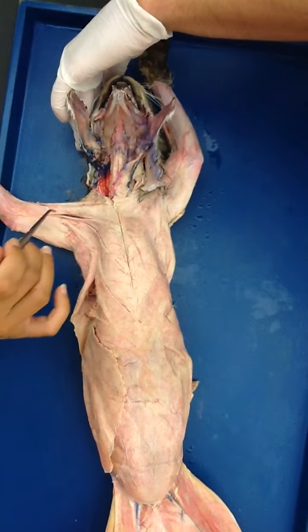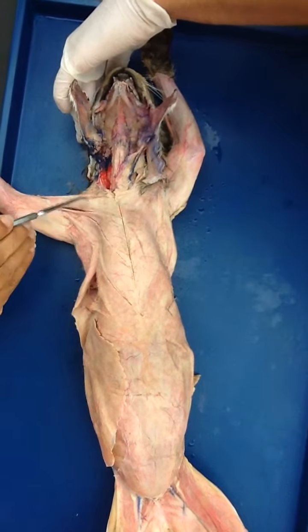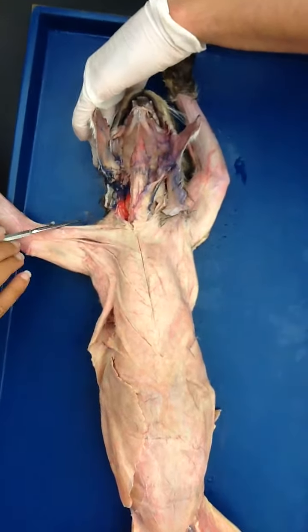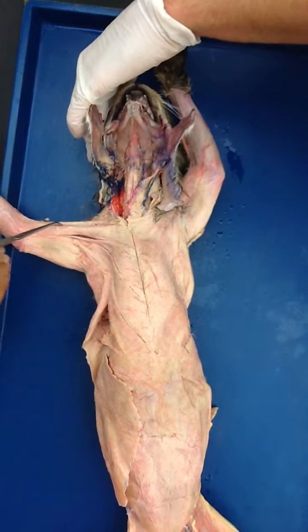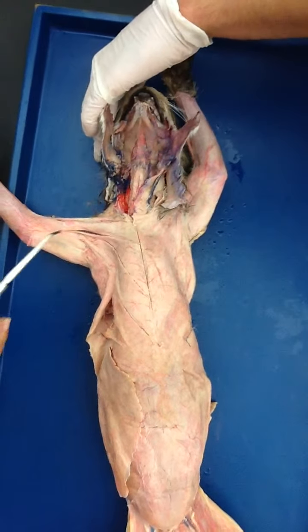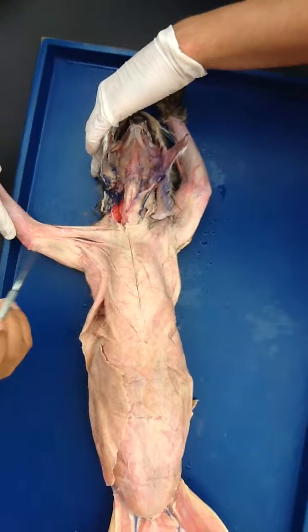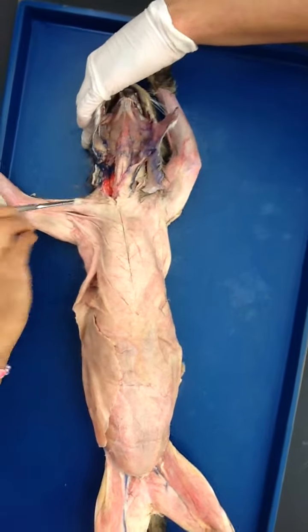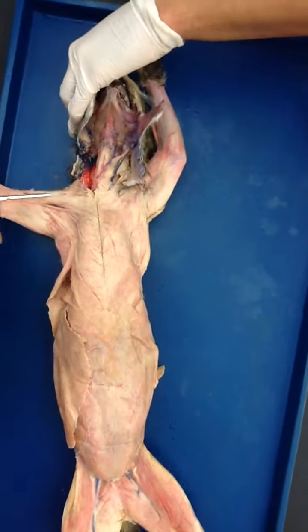Look for the separation — the line separation. So when you stretch it, do you see the fascia in between these two muscles? The fascia divides the muscles and tells you the boundary of the muscle, and that is the boundary along which you should cut.